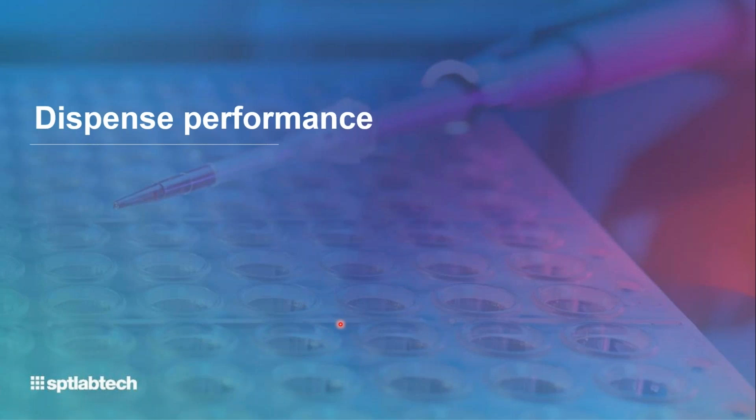So dispense performance. Dispense performance is really fundamental to any liquid handler. It provides the base on which all applications are subsequently built, and also underlies our ability to achieve good sample-sample uniformity.